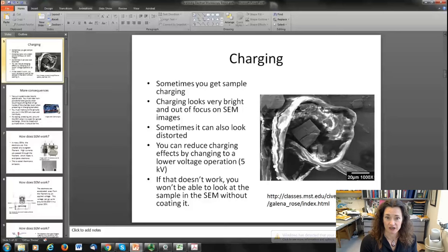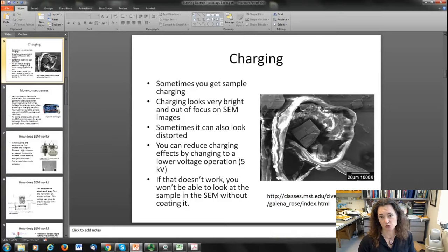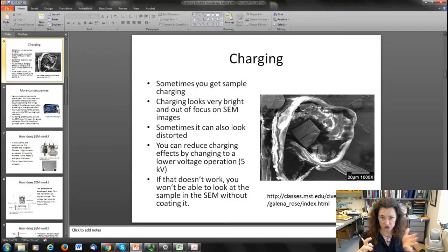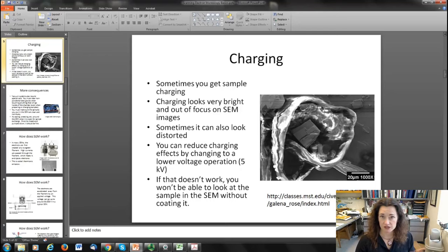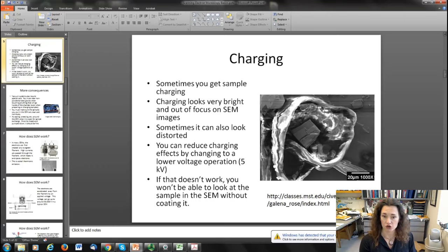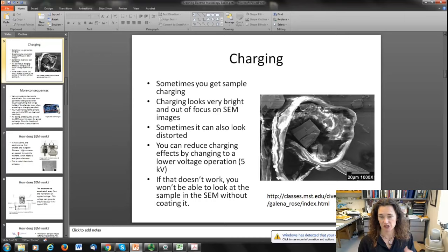When doing imaging in an SEM, you can sometimes get sample charging even after sample preparation steps. What charging looks like in an SEM is a wavery, distorted image — it can also look very bright or very dark depending on the type of charging, making it look like the image is out of focus. You can reduce charging by lowering the energy of your incident electron beam by dropping your accelerating voltage, or by lowering your beam current. You can also go to an environmental SEM where you raise the background vacuum pressure inside the chamber, which helps release some of the charge.